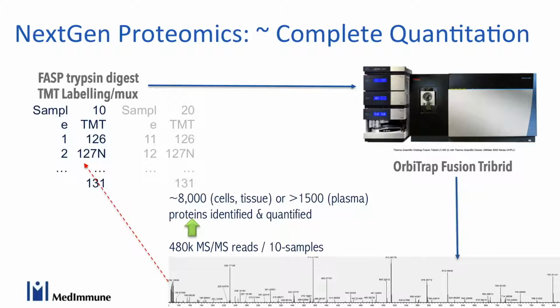But as people who have done proteomics know, this generates a large amount of data, probably not in the same order as genomic data, but still a lot. Very importantly, it's very complicated data. That means we cannot just write down the protein quantification at the end.